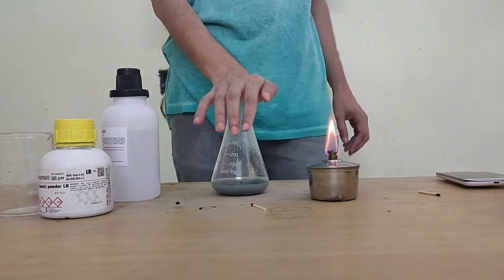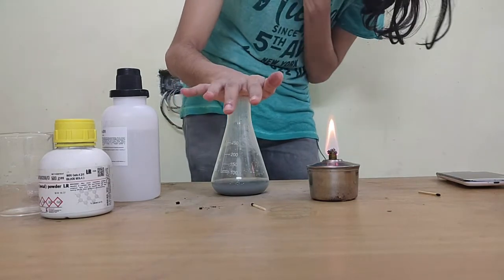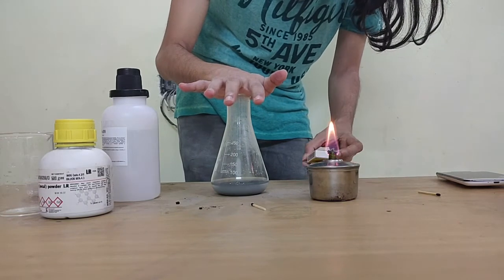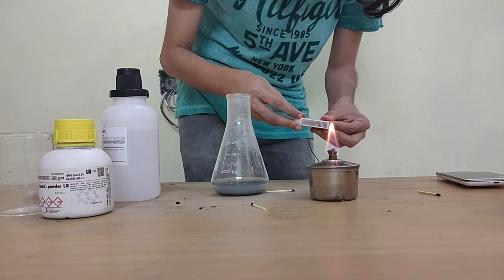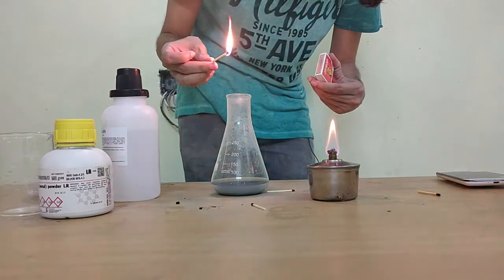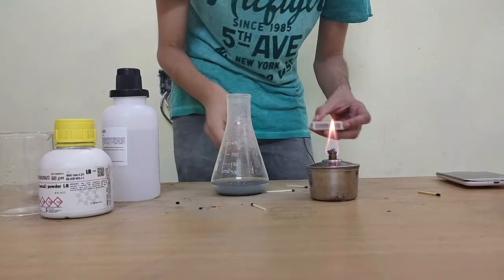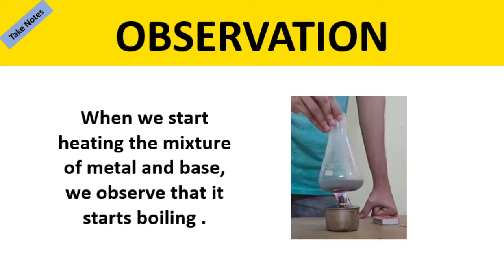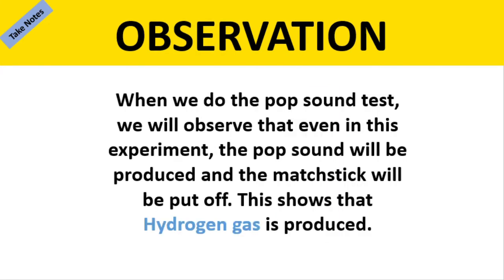Let's just let the reaction happen, let the gas collect. This is hot. Let's try it out again. It's getting really difficult for me to collect the gas here.